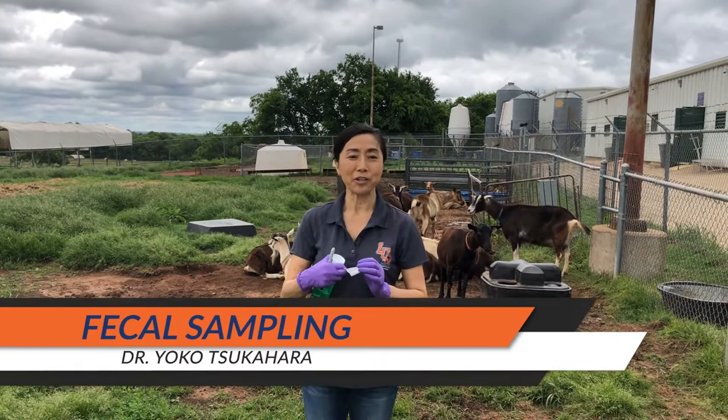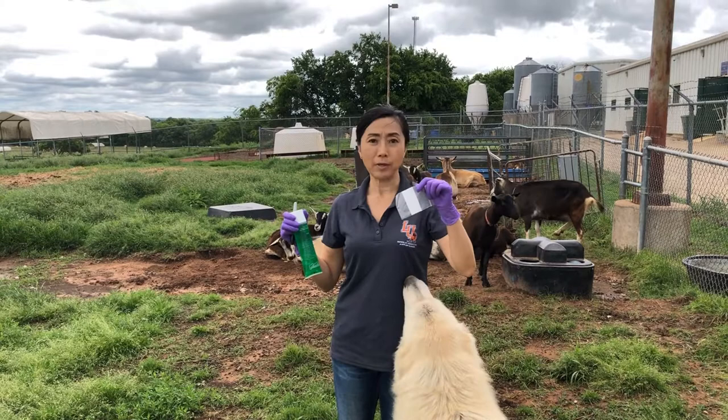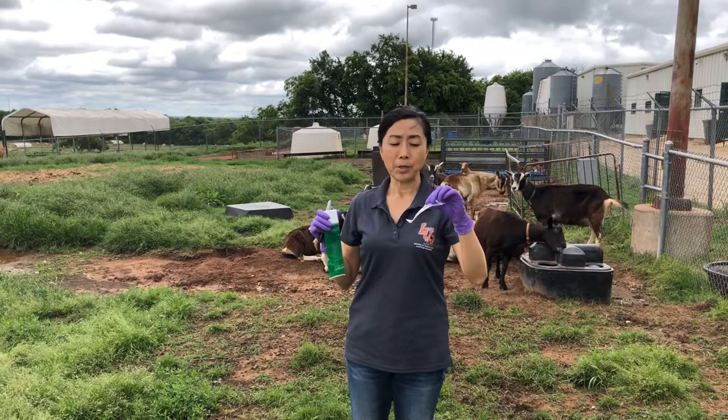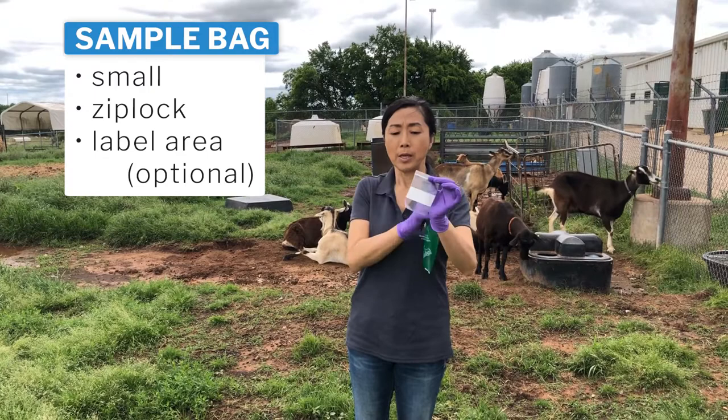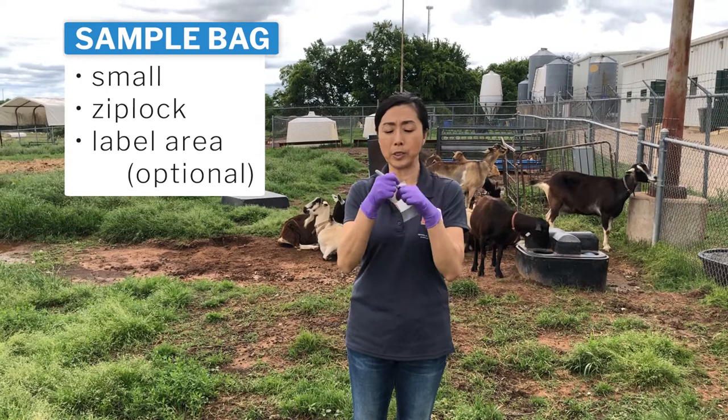I'm going to talk about how to collect faecal samples. Whenever you collect faecal samples, you want to have a bag with a zip. It's ideal if you can have the white part where you can write the ID number of the animal.